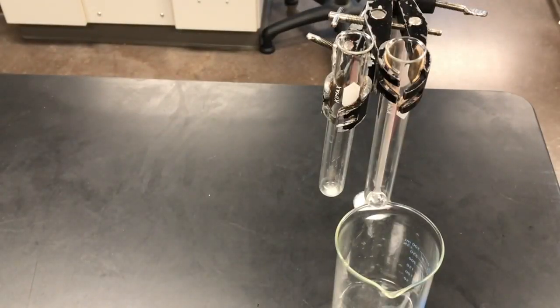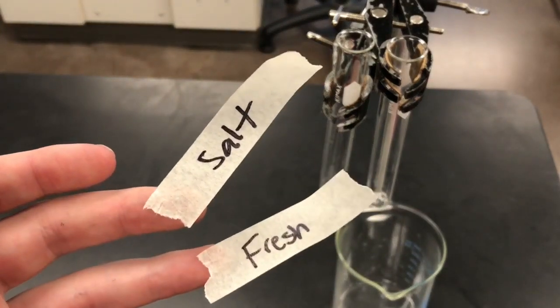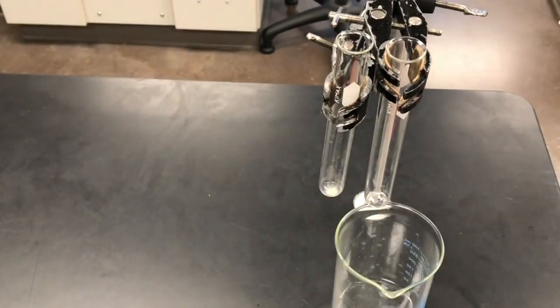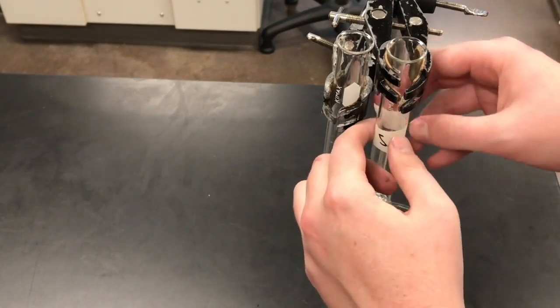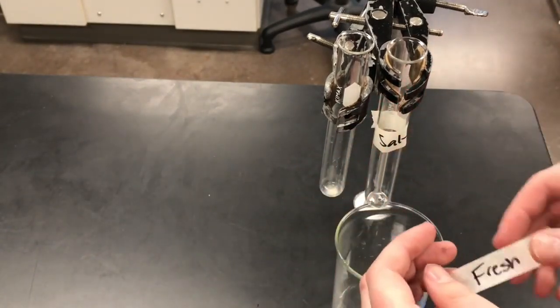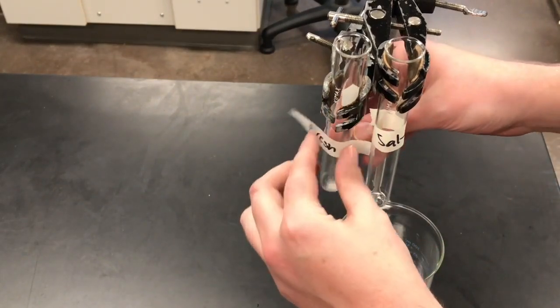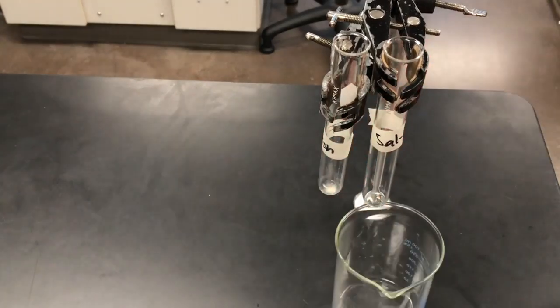All right, so we're going to fill up one of these with salt water, one of them with fresh water. I just took two pieces of tape, labeled them salt and fresh, because you're going to want to keep track of which is which over the course of this procedure. I'm just going to put my labels on the test tubes so that I can keep track of them as we go through this lab.